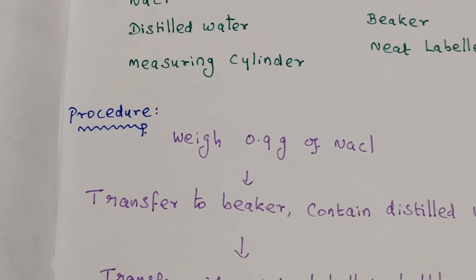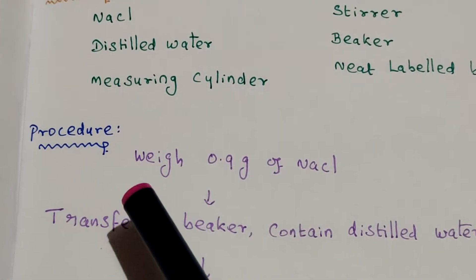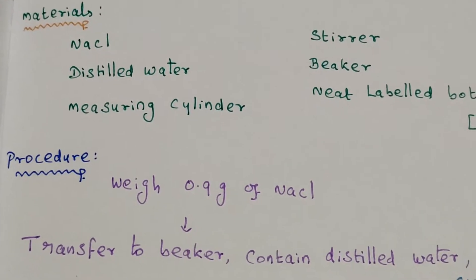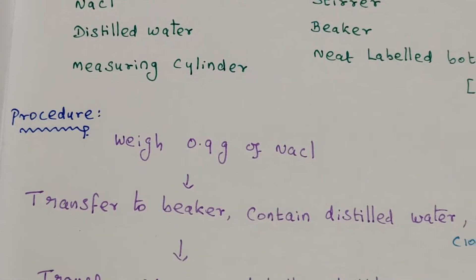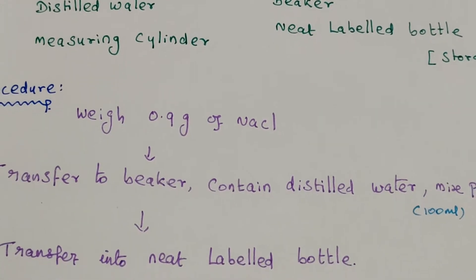Next, the procedure for this experiment. First, weigh 0.9 grams of sodium chloride using a weighing balance. Then transfer it to a beaker containing a little amount of distilled water.